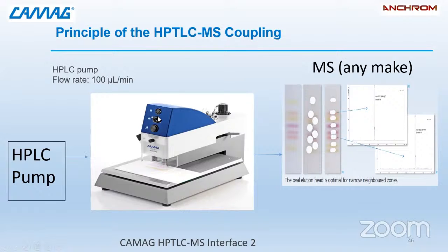Here there is a laser crosshair. This is the piston to bring the instrument in extraction mode. We have this cleaning button to clean the system. This is the knob with which you can adjust the pressure of nitrogen or compressed air, which is required for the pistonic force. There is a 6-port valve for connection of capillaries from LC to MS. And this is the lever to bring the instrument in extraction or bypass mode.